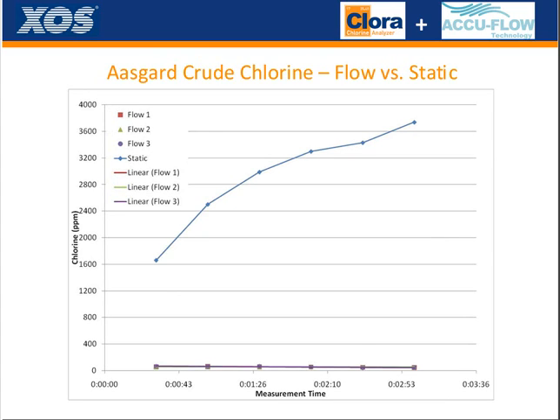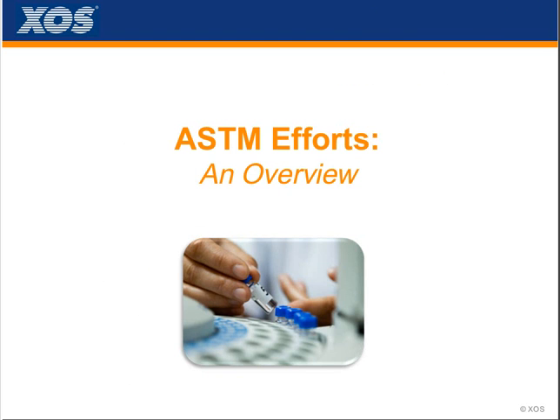So a couple more. Finally, I just wanted to wrap up with our efforts at ASTM. I know this is important to some of you folks out there: what is XOS doing to give us a piece of technology, but also a piece of technology that has a method written around it, something we can point back to, as far as being able to test properly, do the same thing twice, and have a precision statement.